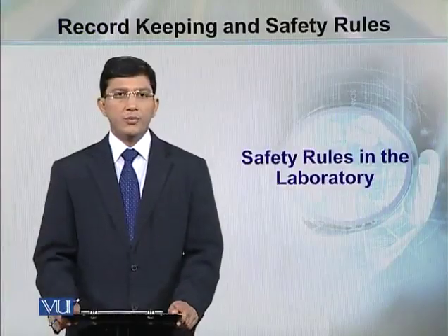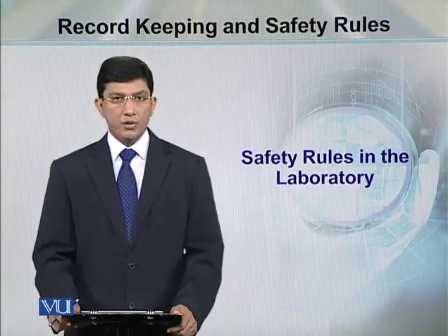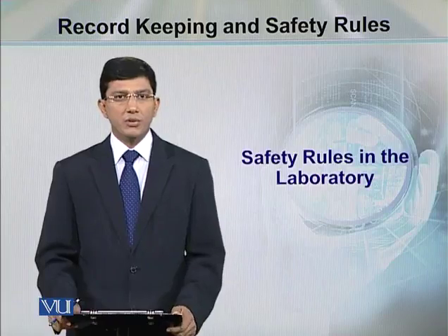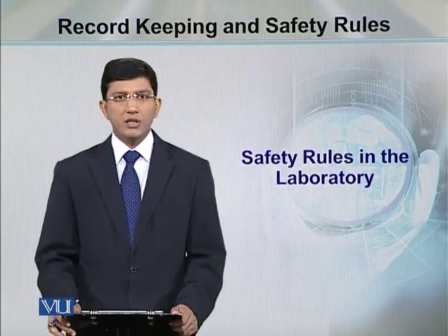Dear students, in this module, we are going to talk about the safety rules in the laboratory. किसी भी लैब में जो है एक्सीडेंट होने के चांसेस होते हैं बिकॉज वहाँ पे केमिकल्स पड़े होते हैं, एसिड्स पड़े होते हैं, फायर का सिस्टम होता है.